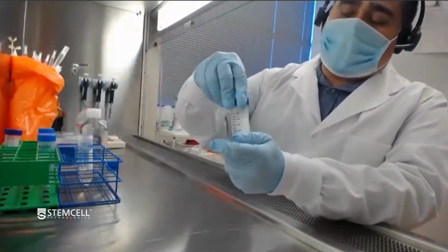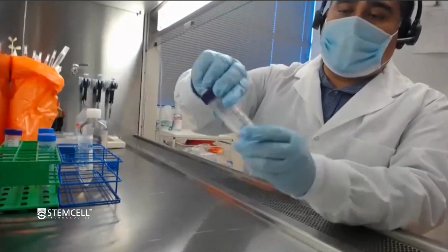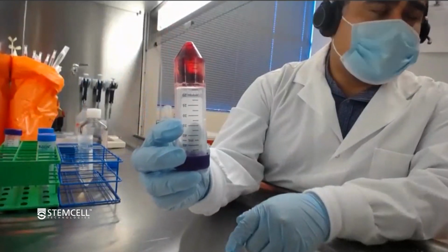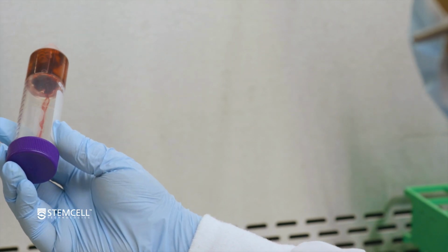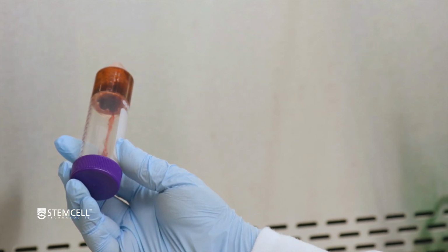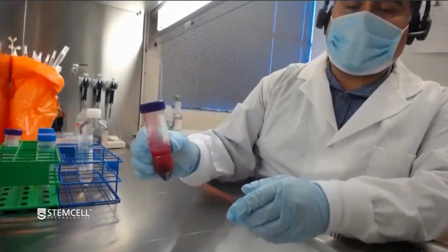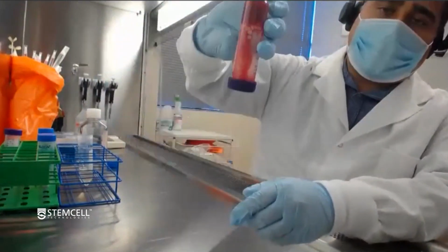this is what I always like to show, that if you invert the tube completely upside down, it doesn't come out all that much, okay? But if I hold this diagonally, that's exactly when it starts to come out. So that's why you want to make sure that when you do the pour, that you're confident and quick. You want to minimize the amount of time that you're holding it diagonally. You want to do a nice quick inversion.